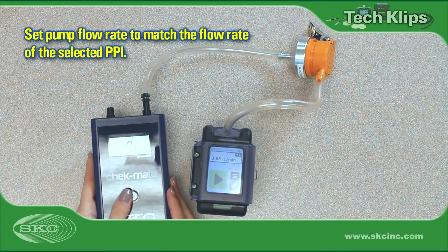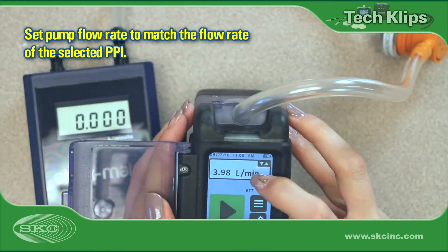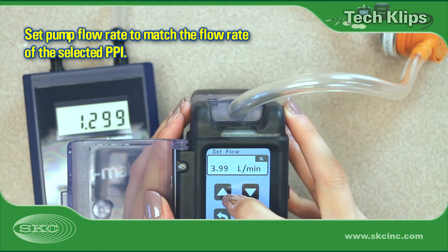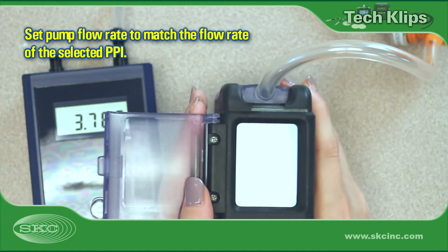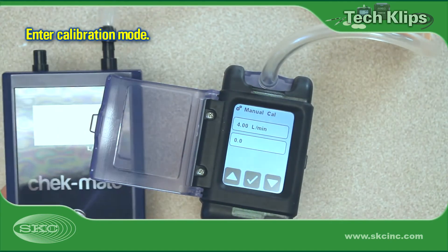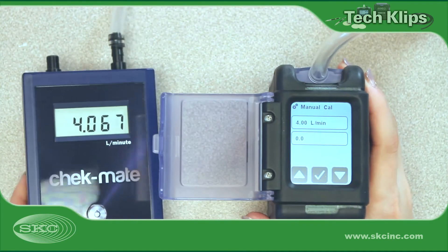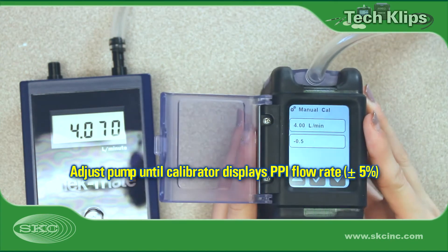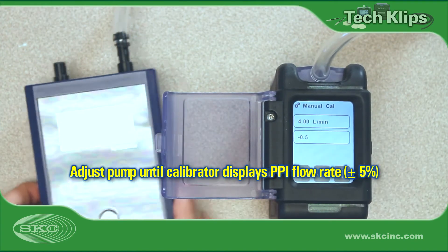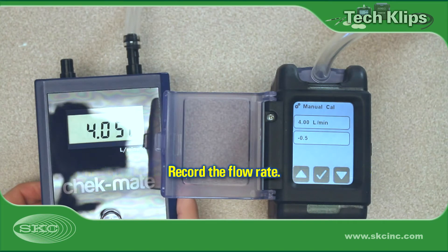Set the pump flow rate to that required by the PPI model used. This achieves the closest match to the respirable or thoracic ISO 7708 size criteria. Enter calibration mode on the pump — see pump operating instructions for more information. Observe flow readings and adjust flow calibration until the calibrator displays a consistent reading within 5% of the required flow rate, then record that flow rate.